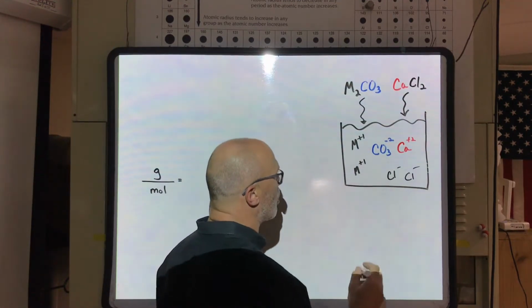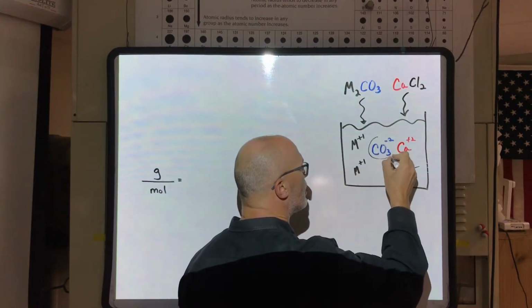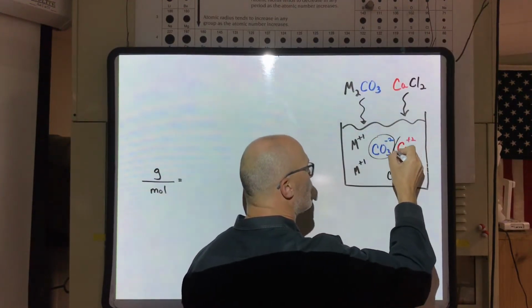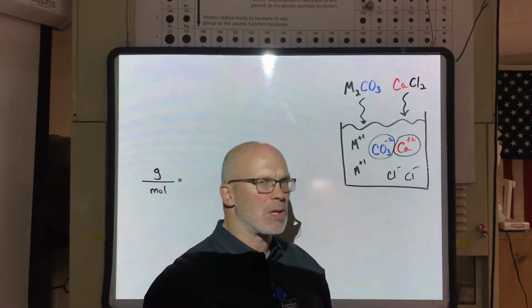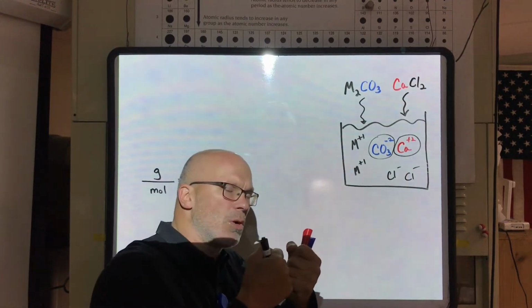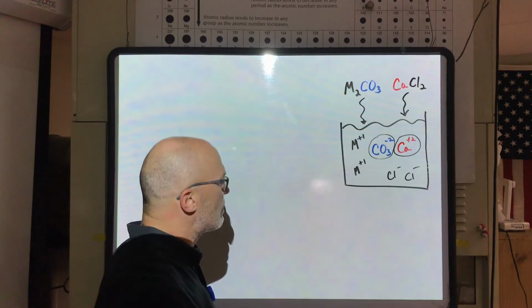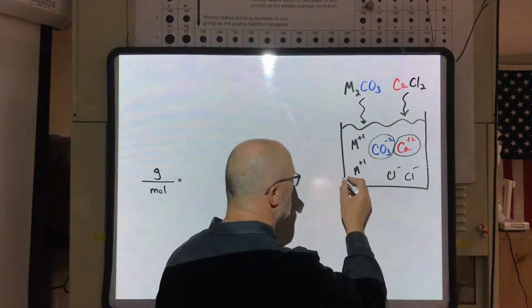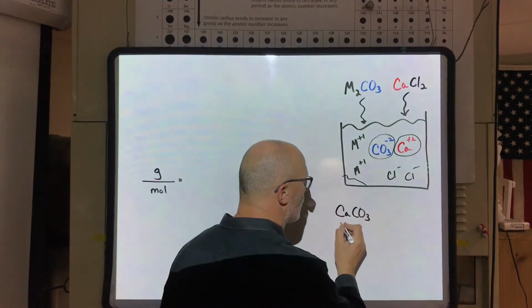That precipitate, of course, is calcium carbonate. The -2 ion here strongly attracted the +2 ion. Based on Coulomb's law, when the size of the charges increase, so does the attractive forces. So much so that water couldn't compete for those charges and dissolve them. All right, so we made calcium carbonate precipitate, and we'll write it here. And we knew that chemical formula.